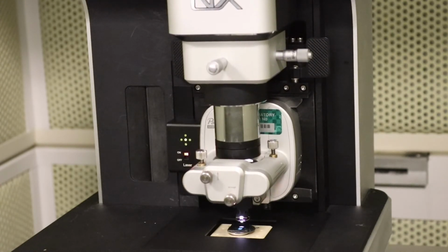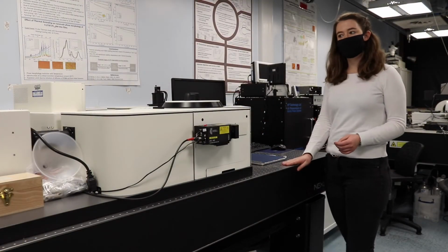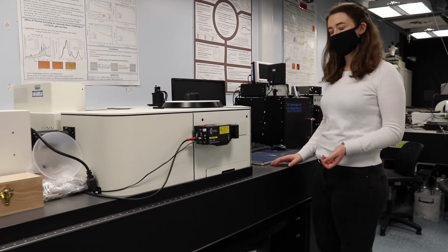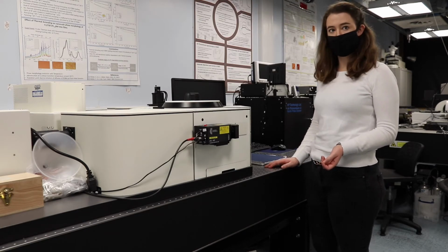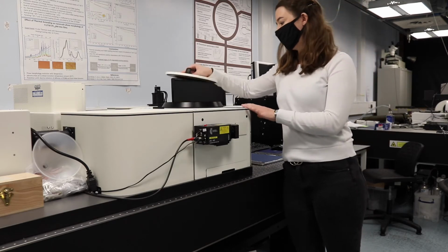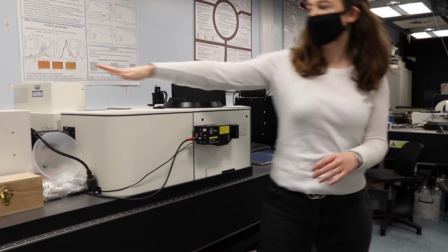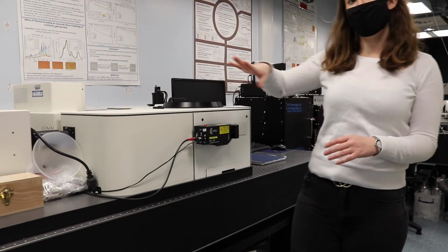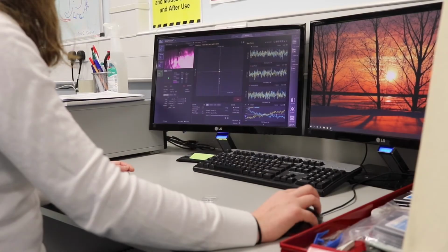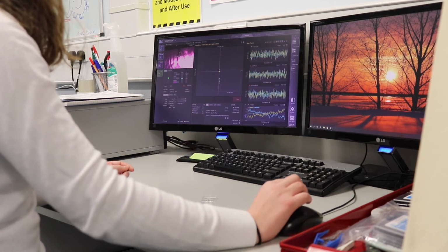of our samples. This is a Fluorescence Spectrometer, so we use this to do photoluminescence measurements and also time correlated single photon counting. We can do this with thin films mostly, just in the sample chamber for the steady state. We also have this cryostat, which means that we can measure at very low temperatures and we can control the temperature right up to around about 300 degrees.